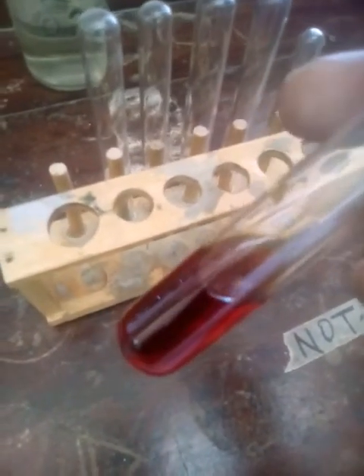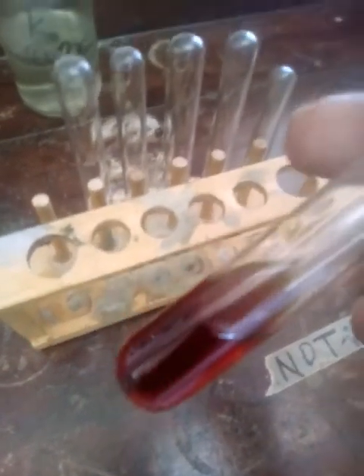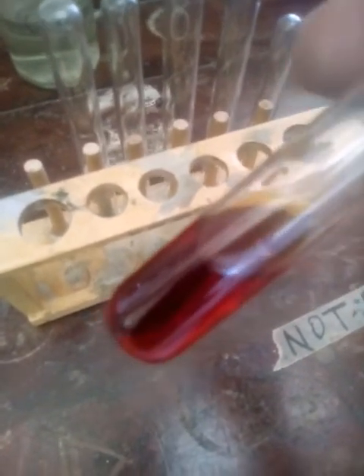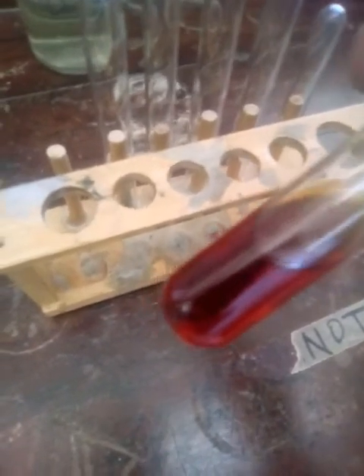But you guys can do your literature review, and if you want to put another color that you are seeing, once it is in line chemically, I don't see where we should have a problem. So just consult the color. But let me get on a white background, so you guys can see the color that I'm seeing here. I'm seeing reddish brown or orange brown, one of those colors. You can always do your literature review to confirm that. But this is the end result of what we are seeing.